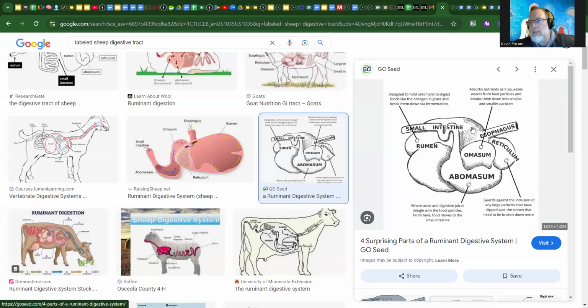We call them ruminants for a reason. The rumen is going to hold on to some grains and grasses, and it's going to ferment those. So food could stay in the rumen for like a week at a time. It's just a giant fermentation chamber. Fermentation happens from the sugars that they're trying to get out of here. All right, so anyway, we'll notice the giant rumen.